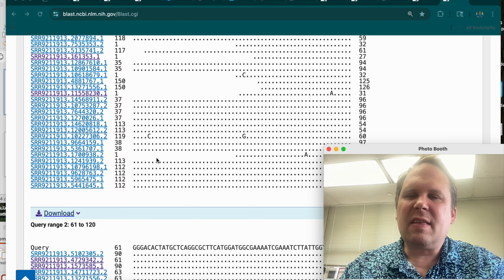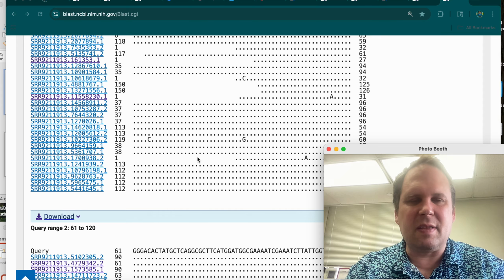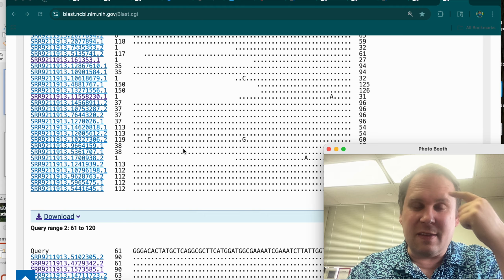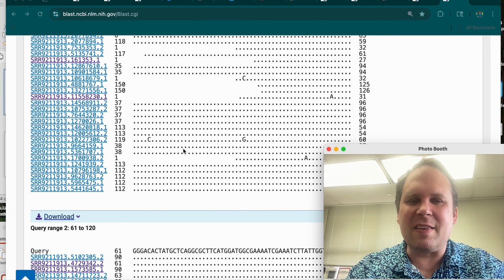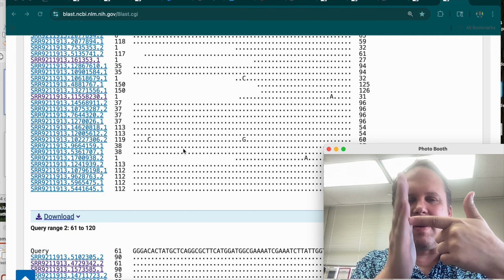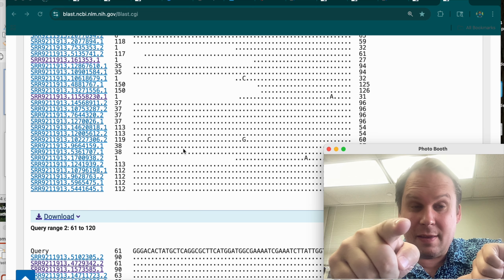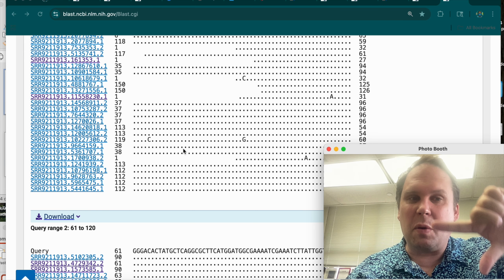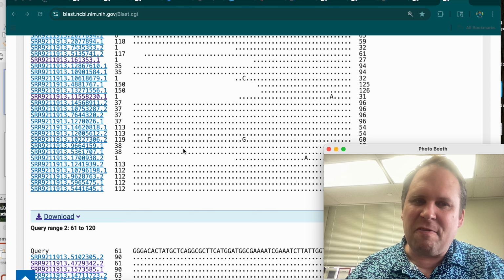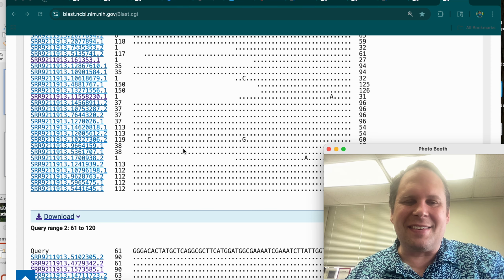And so then we're just going to click now to build out the front end, to build out the beginning of our sequence. We're going to click a bunch of reverse reads. This is like our TED Talk moment where you say, oh. We're going to find reverse reads that line up with the front of the thing we searched for. Because we know that these are paired end reads. Go back and look at the picture of the fish if that's confusing, or Google it. AI is pretty good at these things these days.